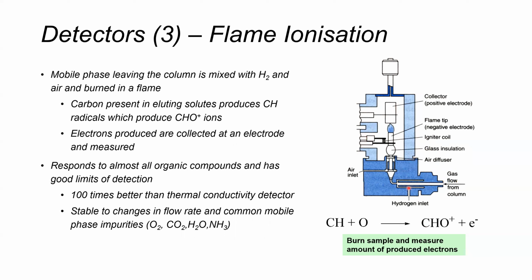This is the process by which a hydrocarbon reacts with oxygen to form CHO+ and an electron. The amount of electrons produced will produce an electrical signal which can be measured.